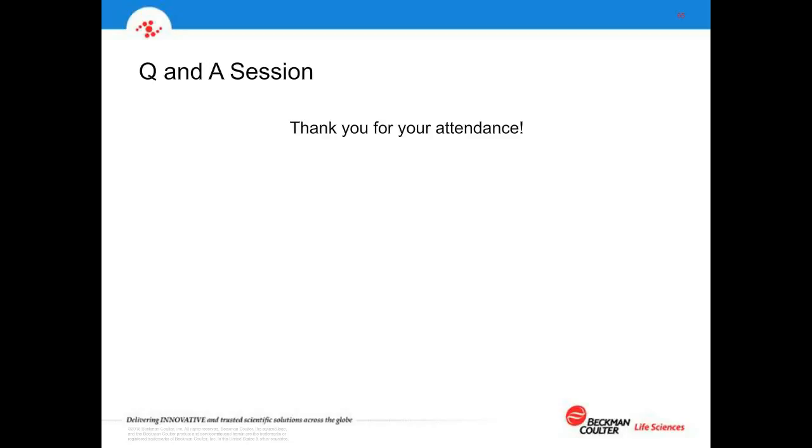And in some ways, you might almost say it's more important in reality, because you want to know that as you use that instrument to evaluate your process day to day or week by week, that your area continues to meet that. And again, by using 21501-4, you have a very consistent method of looking at the health of the instrument each year or every 6 months.